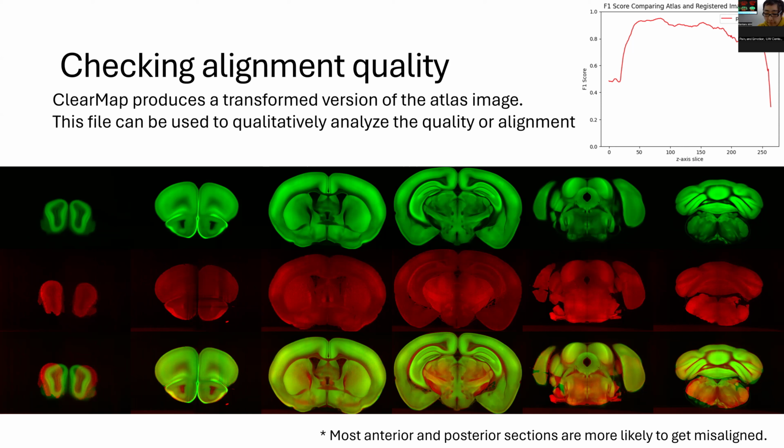If you're particularly interested in a more anterior or posterior region, would you want to adjust where you're centering when you're taking pictures, versus the center proper? Does that make sense? So I think there's obviously the raw image, and the tissue that you're handling should be as close to your atlas as possible.